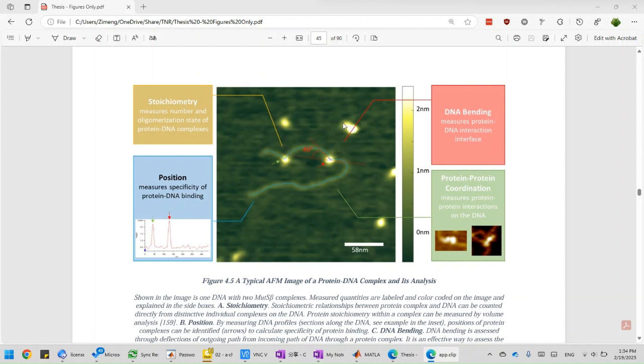For example, in this free protein, we have a much larger volume than all the others. This may be composed of 2 or 3 proteins, right? Versus this one, if this is a single, like the smallest unit, you normalize the volume, that would mean it has one protein in this complex. That's how we can tell.